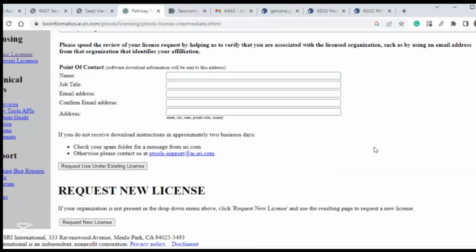So you can go through how you can upload data. You can use the data we have generated from PROKKA, from the RAST server, and from PGAP, from NCBI annotations. The NCBI genome database also contains the GenBank file.